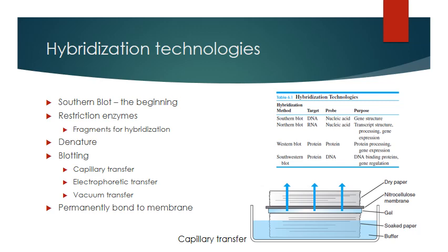Since the evolution of Southern blot, there are several other types of blotting techniques, which are just based off of his name, Southern. It has nothing to do with pointing north or being done in the north or anything like that. In Southern blot, your target is DNA. In Northern blot, your target is RNA. In Western blot, your target is protein.